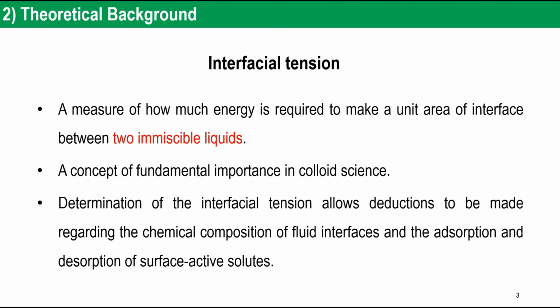Determination of the interfacial tension allows deductions to be made regarding the chemical composition of fluid interfaces and the adsorption and desorption of surface active solutes.